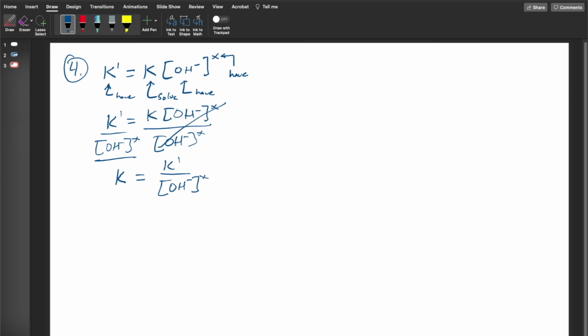All right. We're going to have to do the rate constant for both parts. For part one, with the sodium hydroxide that was at approximately 0.05 concentration starting out, and then part 2, which was the sodium hydroxide concentration that was at 0.1 starting out, right? So here's part 1.